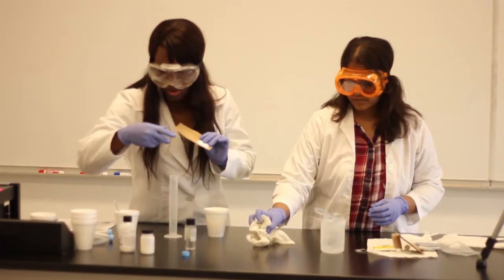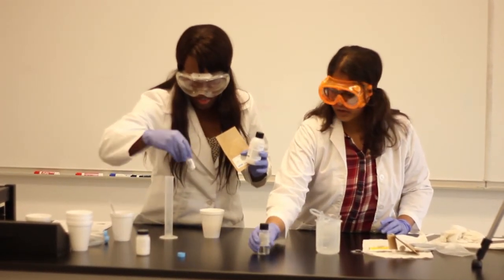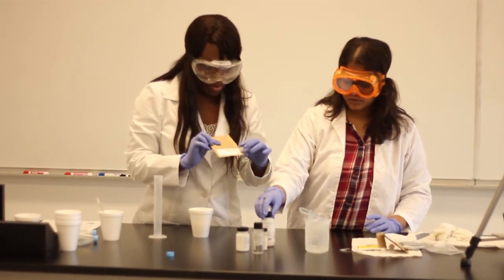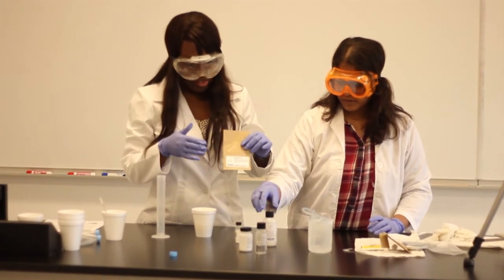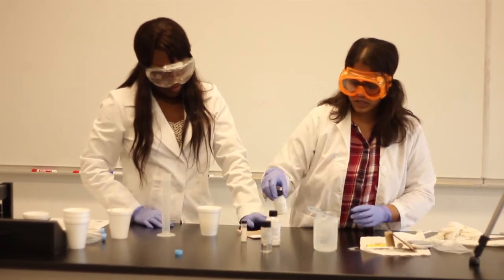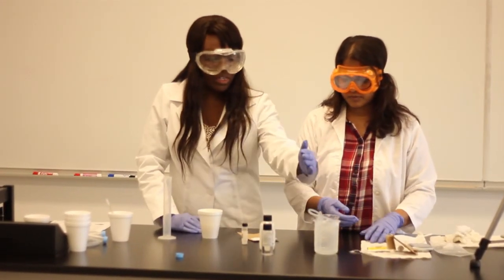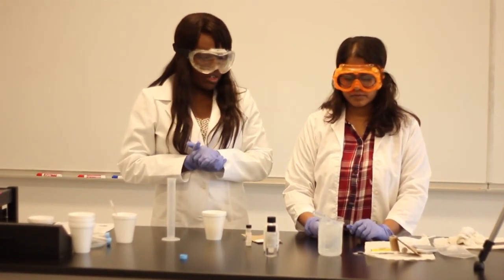So you're provided with lactose, you're provided with starch, mineral oil, the oil to create the layer, glucose, and cellulose. For our first run, we're supposed to be using the sucrose, lactose, what's the other one? And the glucose. The glucose, yeah, that would be your first run. And the second run, they wanted you to repeat the sucrose with the cellulose and the starch. Right. And the reason why you're separating them is because of the materials you have. You only have 3 setups. So you're doing the exact same setup 3 different times for 3 different sources of sugar.